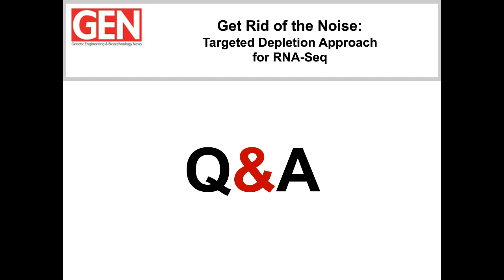A good question, especially at the lower input range. Removing genomic DNA is really important. And there are two ways that we can tell in doing our in-house experiments. In our RNA-Seq analysis pipeline, we routinely look at the percent strandedness of the final library. Solo does incorporate a step to retain strand orientation, and so your strandedness should be very high, above 90%. That will tell you that you have removed genomic DNA. If you have not, you would expect a value for strandedness closer to 50%.